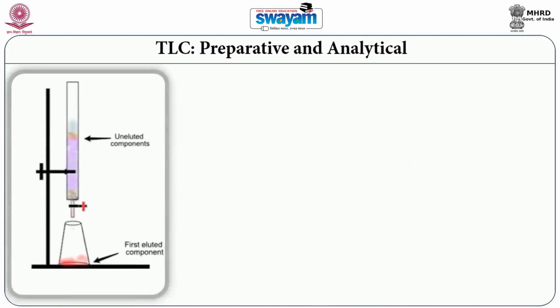Now, the use of TLC began in the early part of the 20th century, and at that point in time it was mainly a qualitative method.